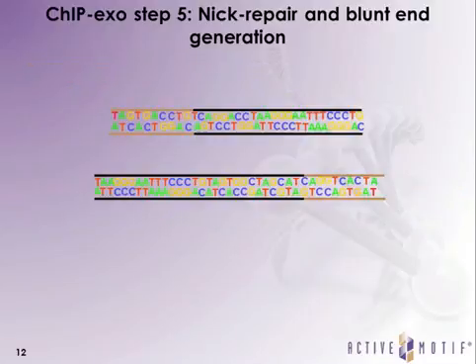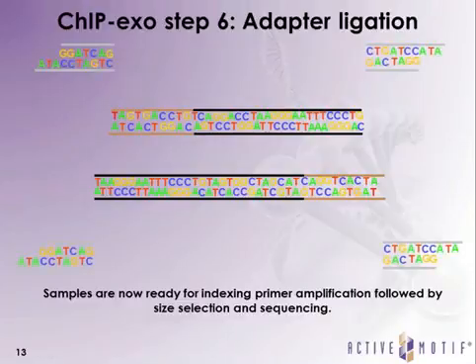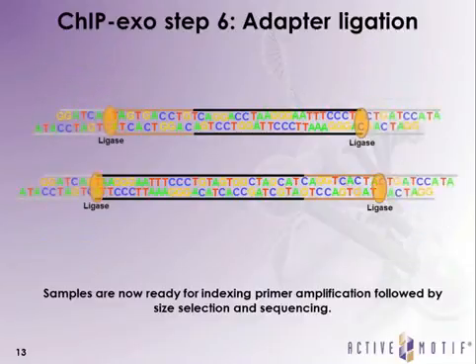And now using these double-stranded DNA fragments, we see that we have 2 fragments, once again, which are smaller than the original fragment that we originally had. And we now come in with a second set of adapters, and these adapters we ligate onto these fragments using, once again, a T4 ligase reaction, and it is these adapter sequences which will match up well with your indexing primers, which allows you then to use your indexing primers to create a small level of amplification.